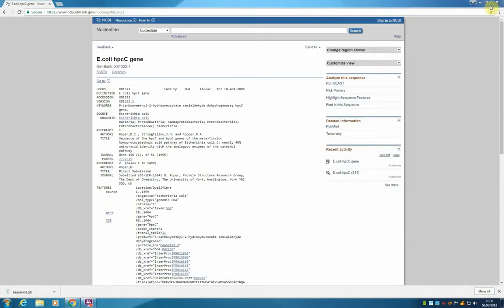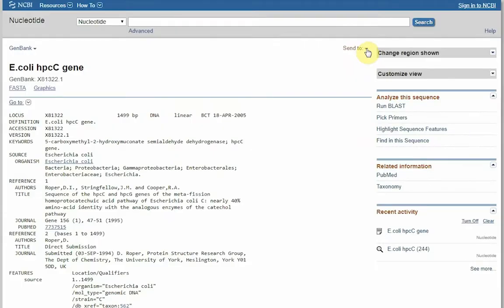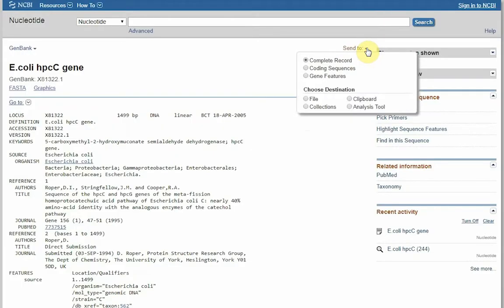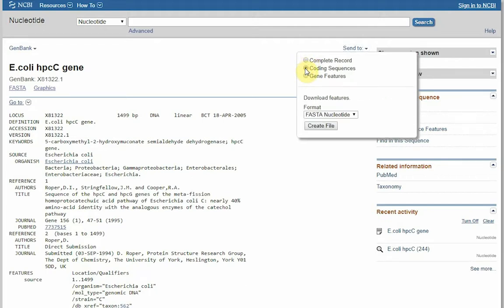I am now going to close this file, and I am going to show you how to download a FASTA sequence from this gene. We are going to use the same drop down menu, send to, but instead of doing complete record, we are going to choose coding sequences.